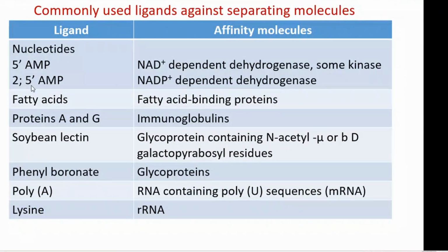So sorry, the fatty acids will be used as a ligand and can be separated with molecules like fatty acid binding proteins. So they can be easily isolated. These binding proteins will always help us to know the biological functions of these molecules, how they can perform the function and the molecular mechanism of the binding, and then preparation of any other molecule that we will see.